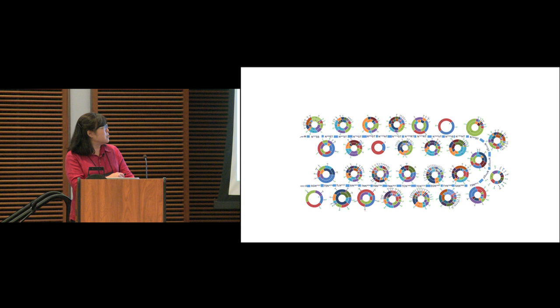This allows us to investigate what we call glycoengineering, where we modify the glycosylation enzymes in the CHO cell and see how the glycosylation changes, allowing us to modify the glycoform that we need to express in the CHO cell for drug production. So this is the workflow I described and its application for N-glycoproteomics.